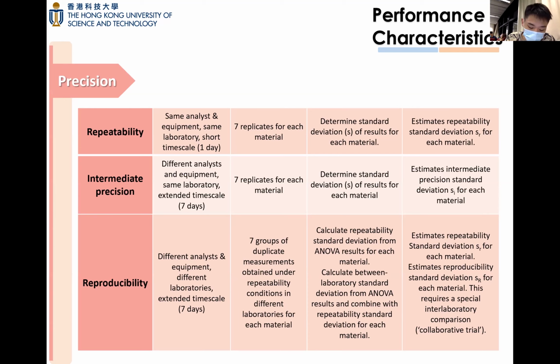Here I designed 3 experiments to measure repeatability, intermediate precision, and reproducibility, with spiked sample blanks at various concentrations across the working range. That's my part.